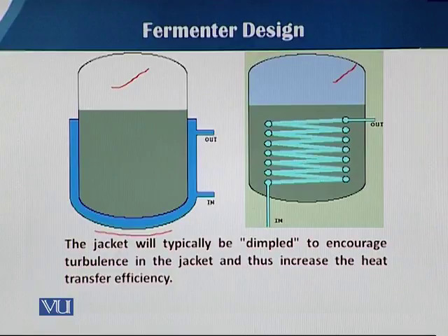In these two cases, chilled or hot liquid is used for temperature control. That can be water or another liquid. In some cases, the blanket or jacket is just dry heat: a direct electric heater is used as a blanket. That is mostly used in lab scale fermenters.